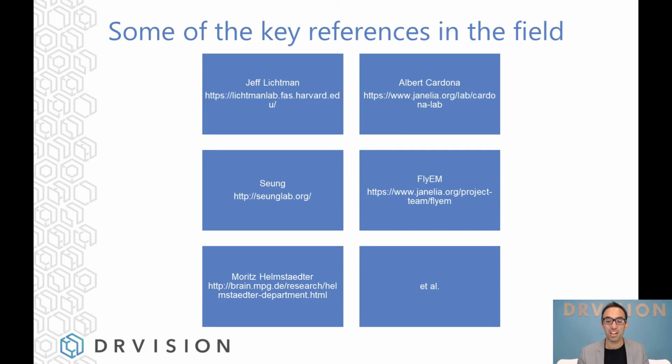Before us, however, there are quite a lot of people doing this kind of work, and they're doing amazing work. You should check at least these people. There's even more, but these guys are amazing. The labs that they lead are doing incredible work in the field of connectomics, and you probably have seen them at conferences presenting keynote speeches and blowing everybody's mind away with the EM reconstructions they are able to create. They are often leveraging machine learning and deep learning in those presentations, specifically convolutional neural networks, which is what we are using.